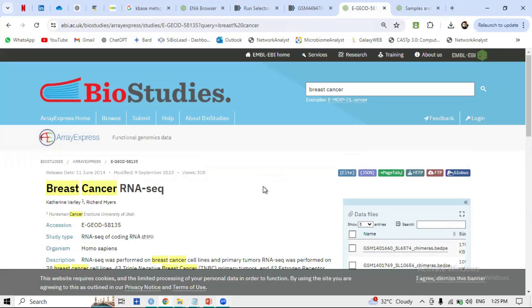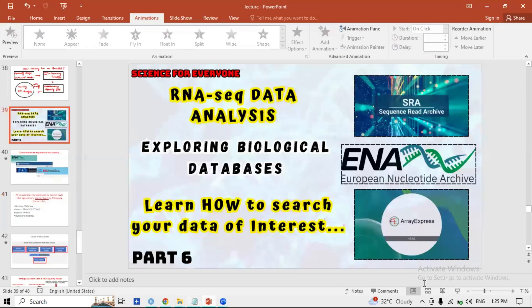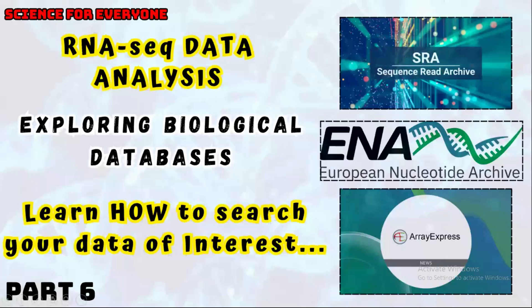This was a short video on exploring biological databases and choosing your samples — how to find your RNA-seq FASTQ files and select the ones you are interested in. That's all for today's video. It was a bit longer but important for searching your data of interest.